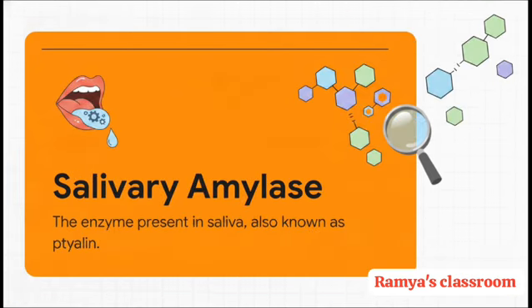Next up, we have our active worker, salivary amylase, also known as ptyalin. Now, this is an enzyme which basically acts like a tiny biological machine. And the truly amazing part, it's found naturally right inside human saliva. This is the catalyst that's going to interact directly with our starch substrate.